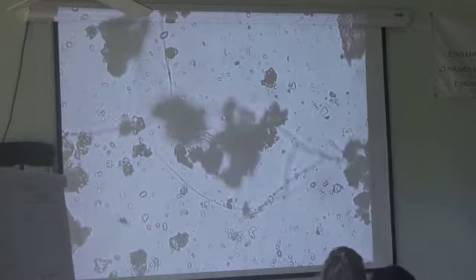There's one more thing we can do to make this a really optimal experience for your eyeballs, and that's to get both of your eyes at the same level of focus. So with my eyepieces, I'm going to do one more little bit of work. You'll notice most of the time there's going to be one eyepiece that has a focusing ability on it. Your other eyepiece typically doesn't have an ability to focus. This one does. So you're going to set your right eyepiece, that focusing one. You're just going to set it someplace. Typically people always set it at the same place. There's a nice little line over here on this side, so set it at 60 or set it at 65. Just pick a place to put it.